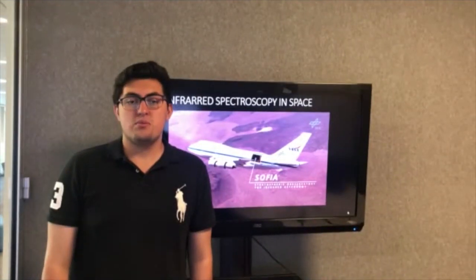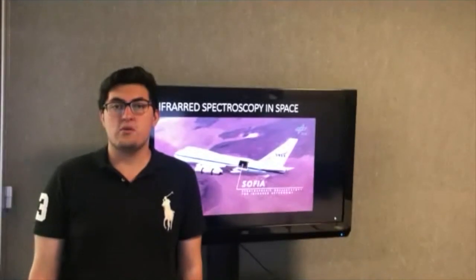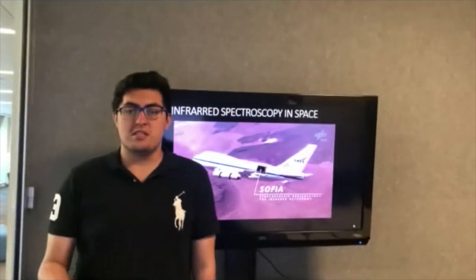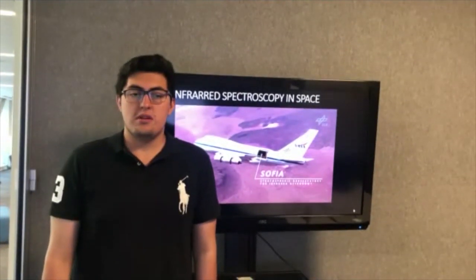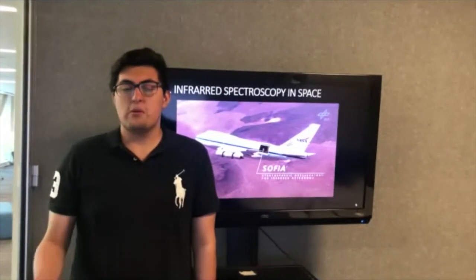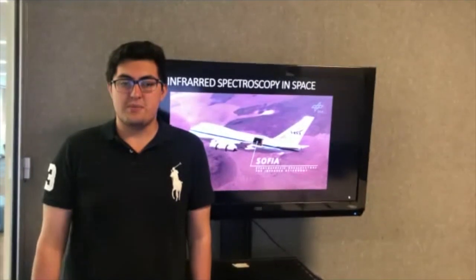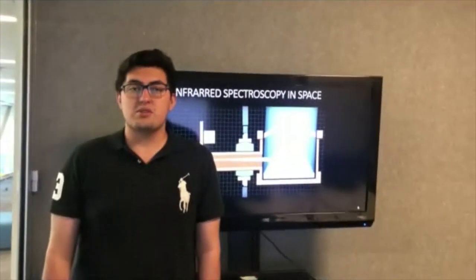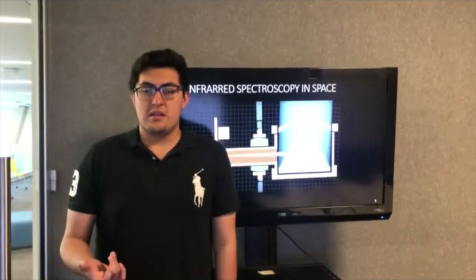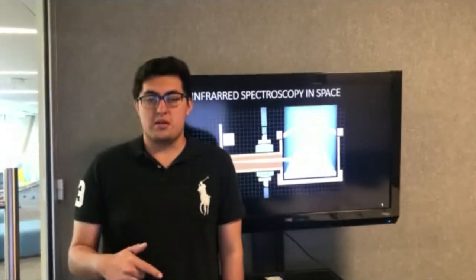The infrared spectrum is useful for space exploration because, unlike other electromagnetic waves, infrared is not absorbed by the dust or other substances in space. The water particles in the Earth's atmosphere interfere with the spectra, so it's preferable to conduct these experiments in the stratosphere or in deep space. The spectrometers in these missions are not that different. The only difference in the design is that we only care about the radiation emitted from planets or stars.